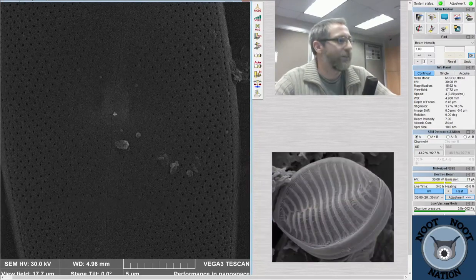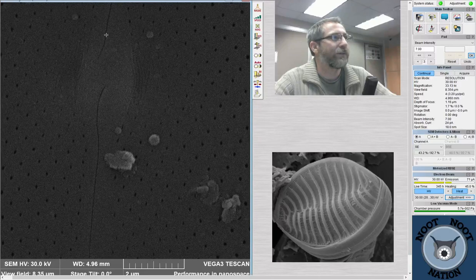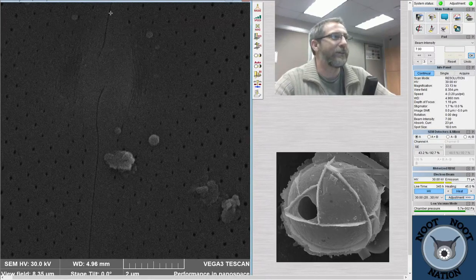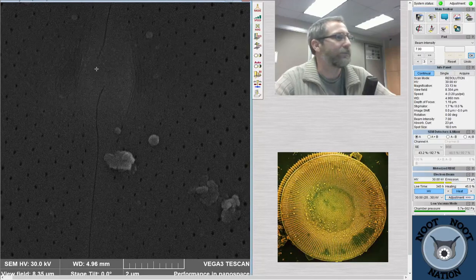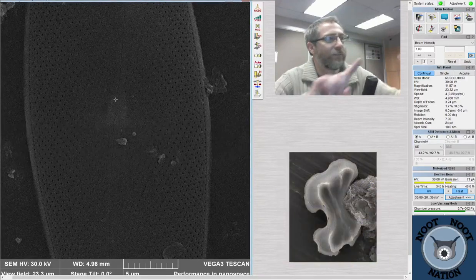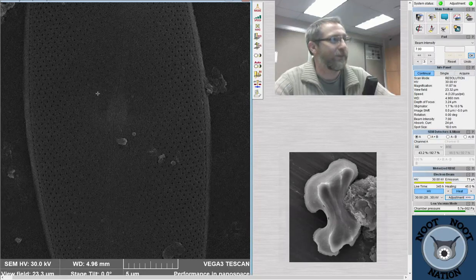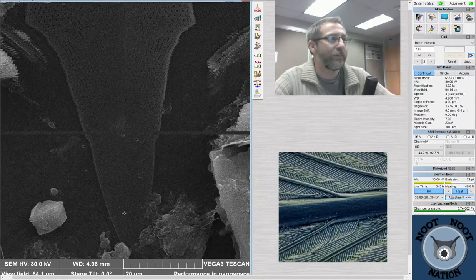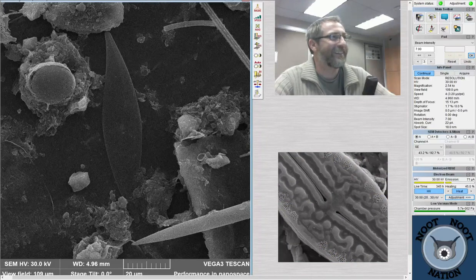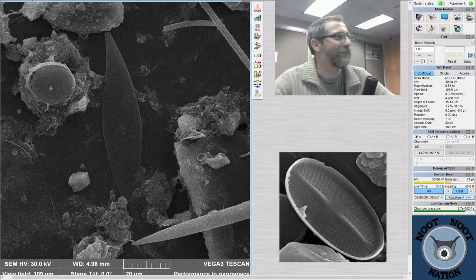And that's the primary way that you would tell them, besides the fact that they have the raphe ends that go in opposite directions. So when you look closely at the raphe, which is the structure right here, one curls to the right and the other one curls to the left if you're coming down the raphe the same direction, right? So they're going in opposite directions on the valve face. So that combination of alternate raphe positions, the decussate positions of the striae or the stripes on the valve face, and the fact that they're sigmoid in shape. So if I zoom out, it will look a little bit like a squished out Dairy Queen logo. If you're from North America and you recognize Dairy Queen, it has a sort of food processor blade shape to it.